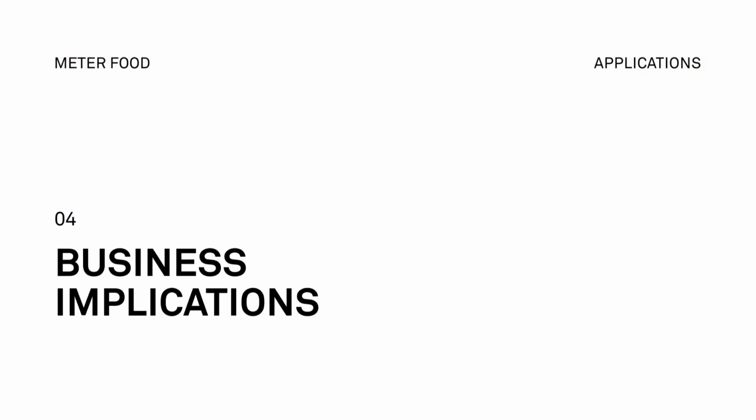So I think that's it for looking at mixing and talking about moisture migration. In our next section, we're going to talk a little bit about some of the business implications and some of the successes that we've seen with people who are using water activity and using isotherms to improve their variability and their precision. I think this is a good place to talk about what can impact your profitability and some actual business cases, things that we've encountered as we've worked with customers who work with these natural ingredients.